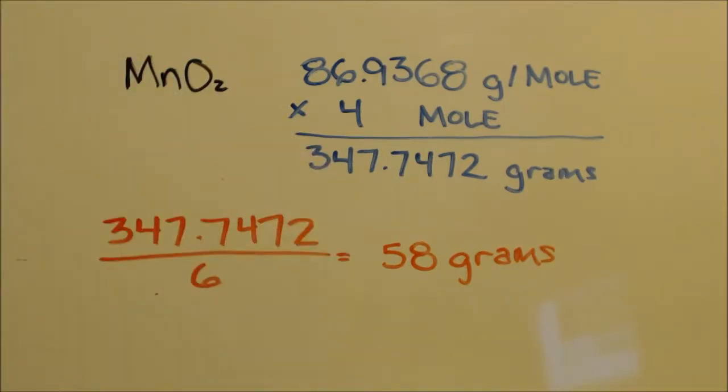I should have 58 grams for the reaction, but you know, that stuff sticks into the filters. You know what I mean? You might end up with only 48 grams or 40 grams. Like I said, I'm going to do mine all at once, so I don't really know.